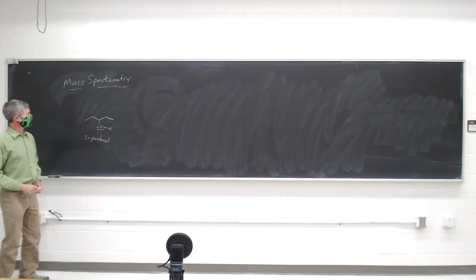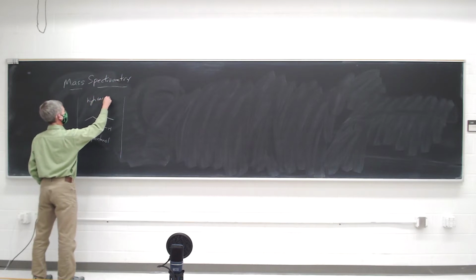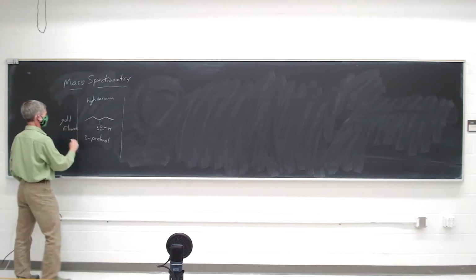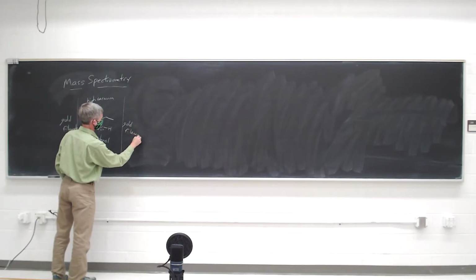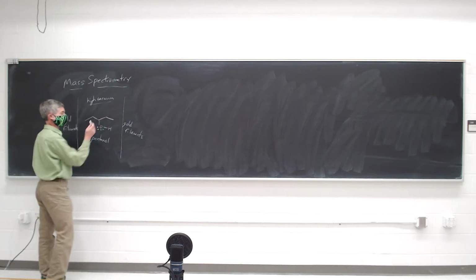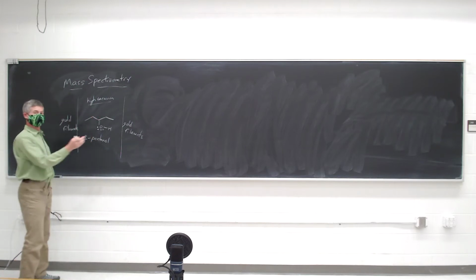Got a lone pair on the oxygen. So what happens is we put this in a chamber under high vacuum, and we have gold filaments on either side of that chamber. And when I'm talking about high vacuum here, I'm talking about probably like 10 to the minus 5 pascals of pressure. So not just a rotary vacuum pump, we have a turbomolecular pump that really makes this a very high vacuum system. So there are not a lot of molecules in there that aren't 3-pentanol.